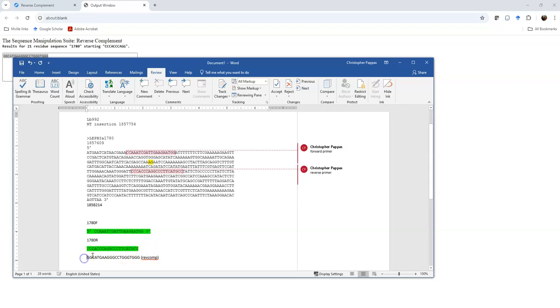This also reads 5', 3', so that's good to write down just like that, because that's how it's going to go into the program. And that's perfect, because see how this is like the GGCA? Look, it's the complement of this, GGCA, just like that. So you know it's going to flip around and attach right there where we need it to go and run in the opposite direction. It's going to run upstream for us. So this first primer, the forward primer, runs downstream.